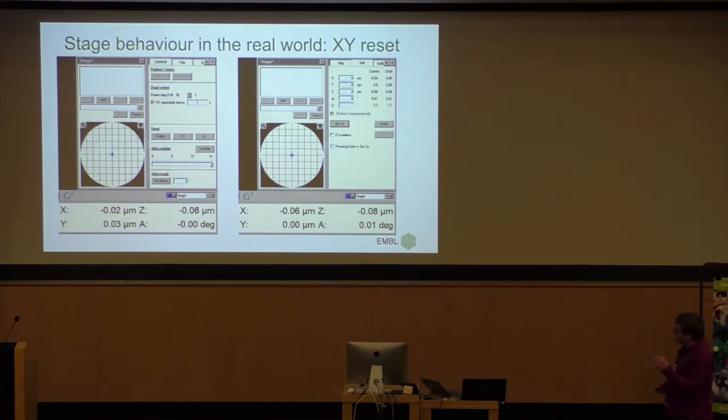To track really properly, first thing you have to realize is the mechanical design of the stage makes that if I tilt, you will see a Y movement. So I'm tilting here, you watch the tilt here, alpha. It increases, and then watch the Y value. 100 nanometers, 170 nanometers, 170. And this is a real movement. So then we go back to minus 70, gets even worse. 300, 600, 700. And this is real.